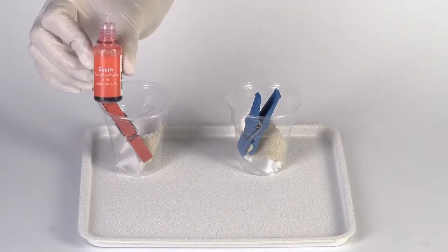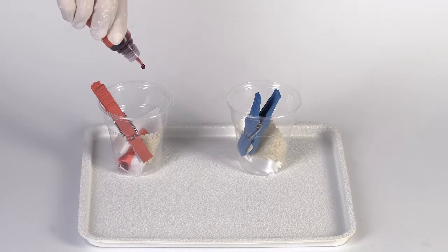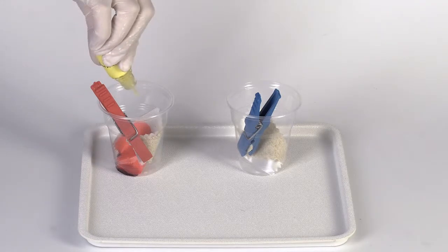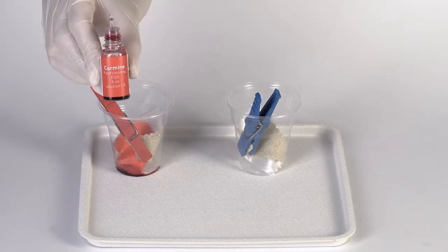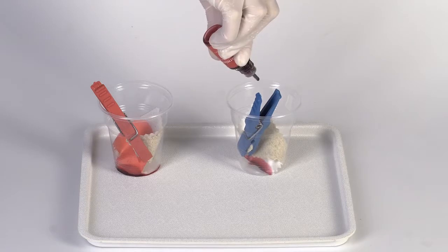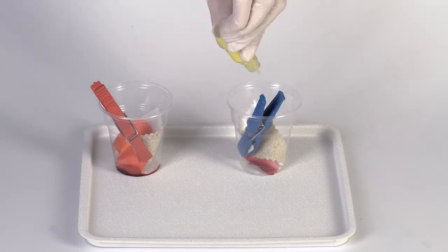Add 15 drops of eosin solution and 5 drops of liquid soap into the cup with the red pin. Then take the cup with the blue pin and add there 15 drops of carmine solution and 5 drops of liquid soap.